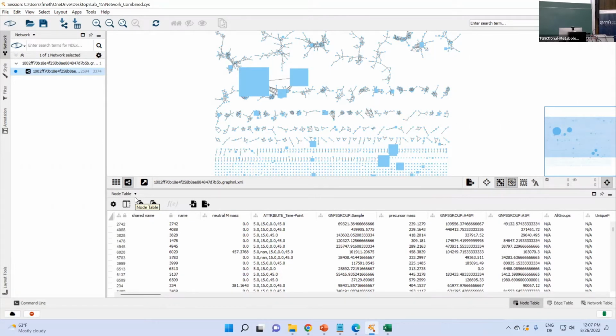And then for each of them, you would need to find this ID column and then split that string into the individual components. The last one, that is.